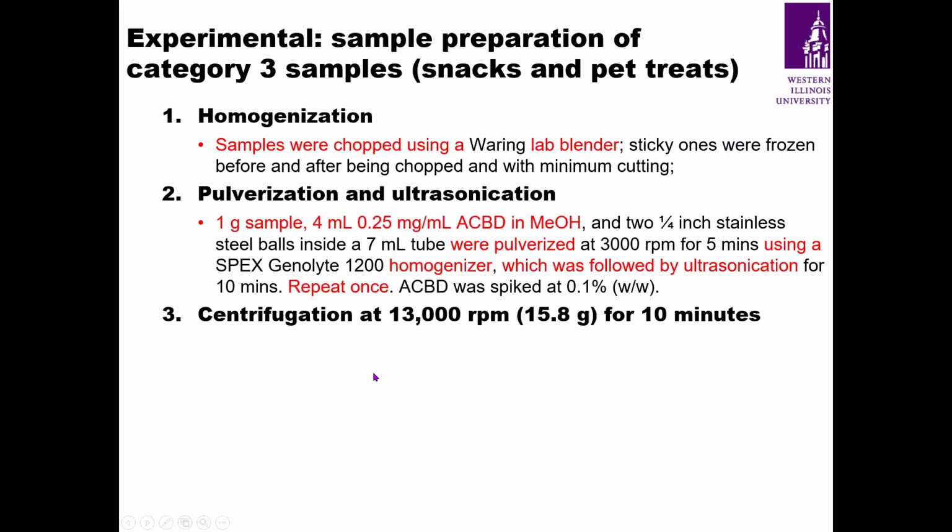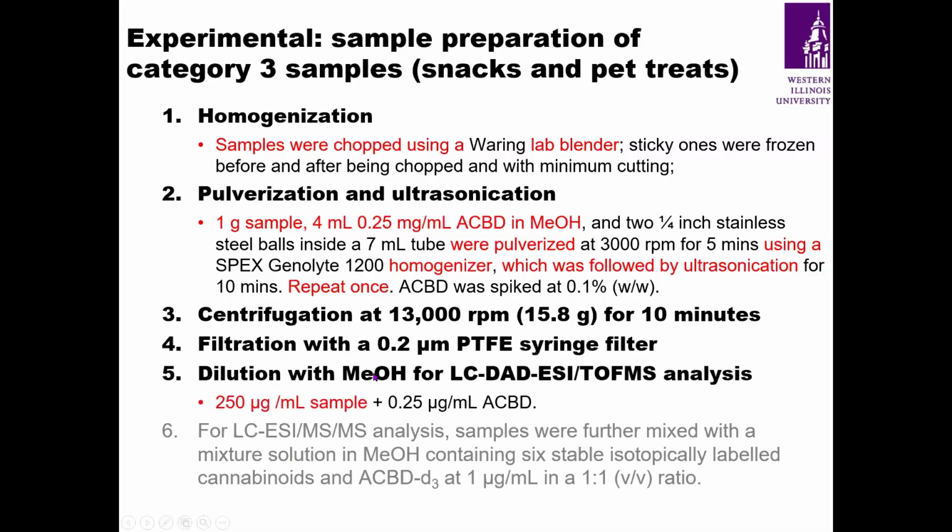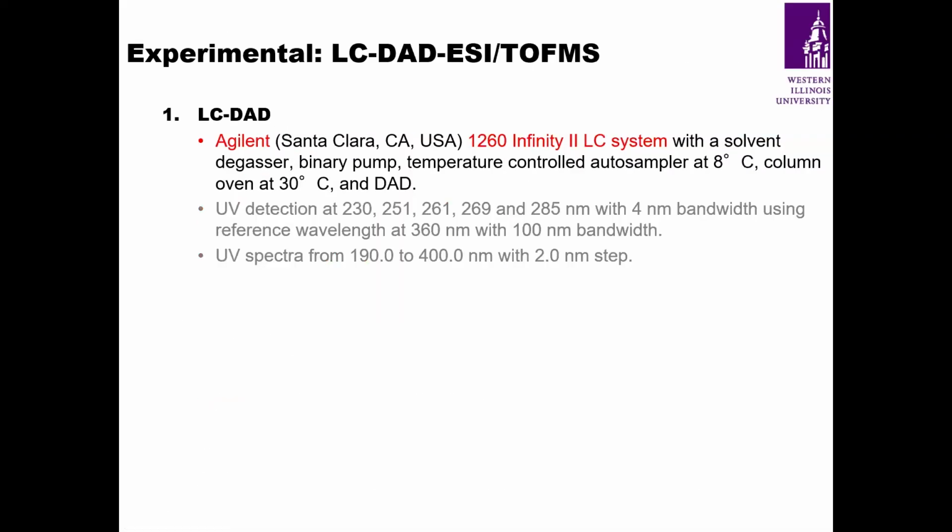Now, centrifugation, filtration, and dilution were the same as previously described. Again, 250 microgram per milliliter sample was analyzed. Now, LC-DAD, we used an Agilent 1260 Infinity 2 LC system. Those we are going to talk about later.